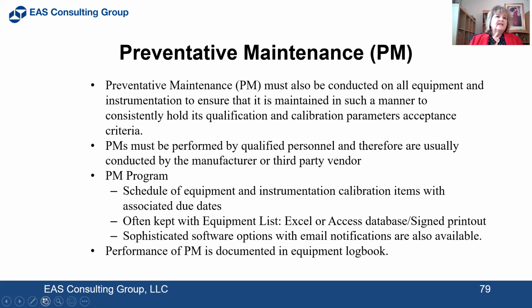You can use sophisticated software options with email notifications that are available. Again, it has to be Part 11 compliant if you go the software route. And then you want to make sure that the performance of your PM is documented in your equipment logbook.